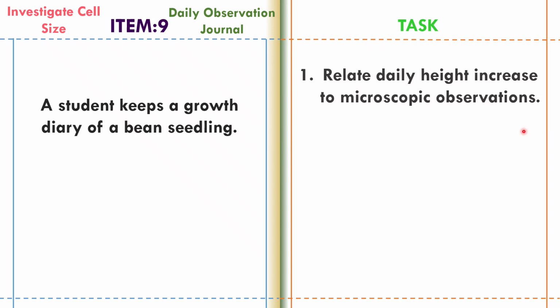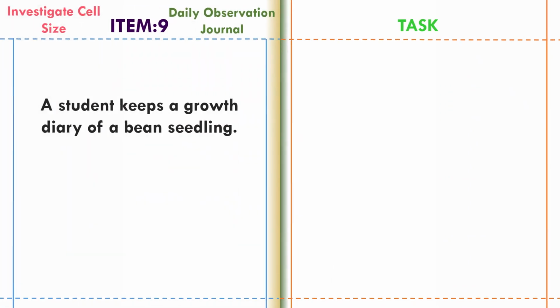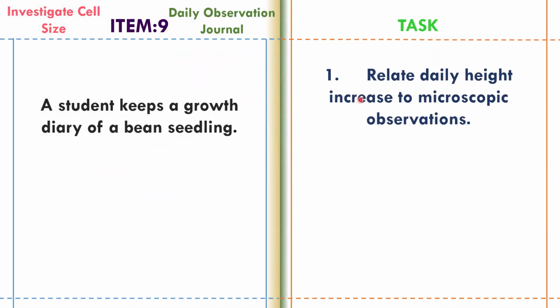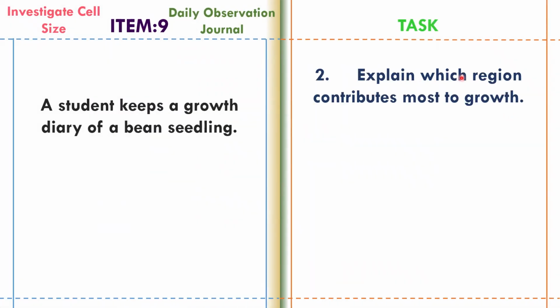Tasks: relate daily height increase to microscopic observation, and explain which region contributes most to growth.